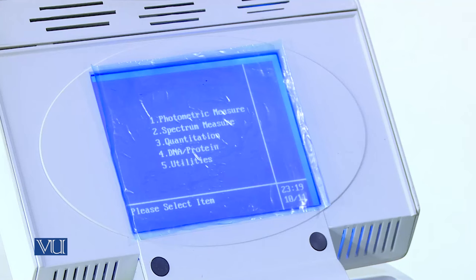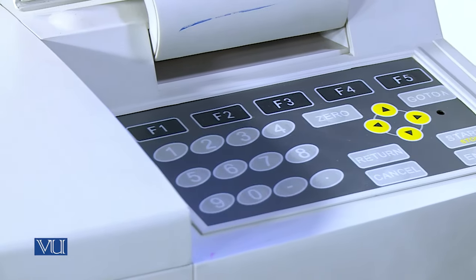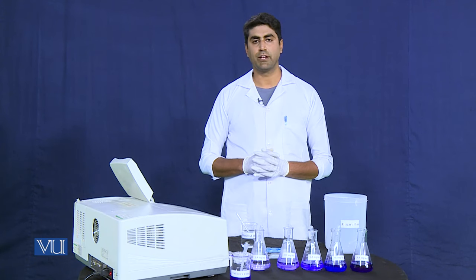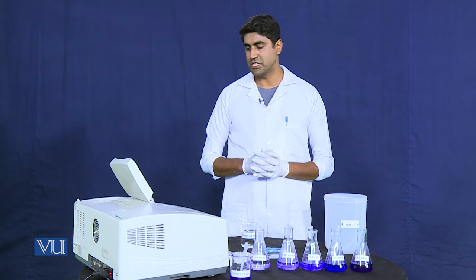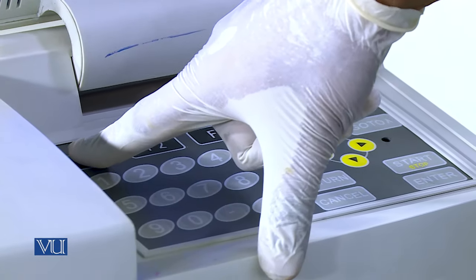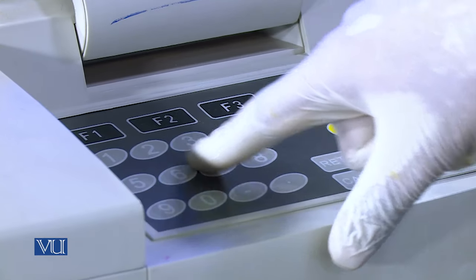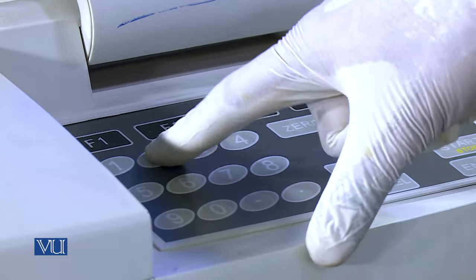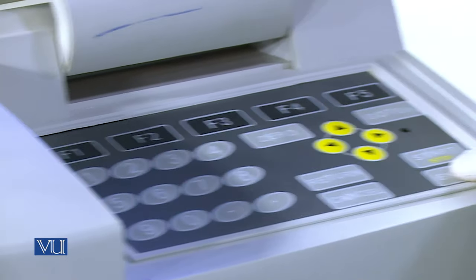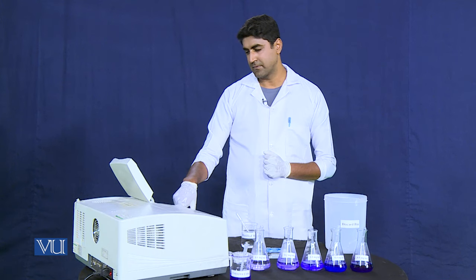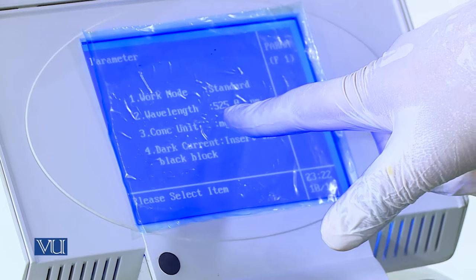Now we will select the parameters for absorbance and select quantification. We can see 400 nanometers wavelength is currently selected, but potassium permanganate absorbs light in the range between 525 and 530 nanometers, so we will change the wavelength. By pressing F1 and then 2, we select the wavelength field and enter our desired wavelength of 525 nanometers. The wavelength is now set to 525 nanometers.